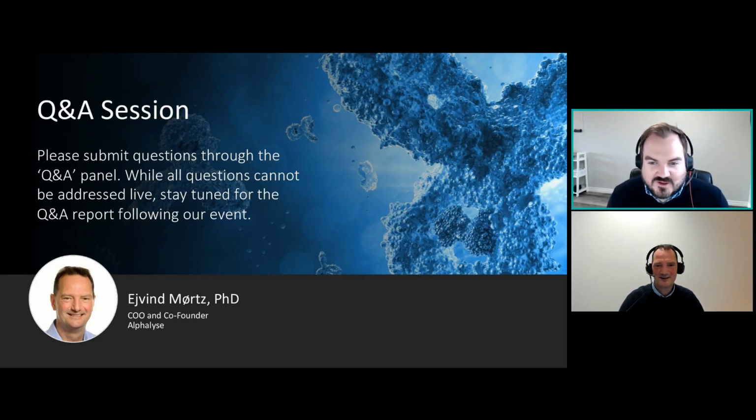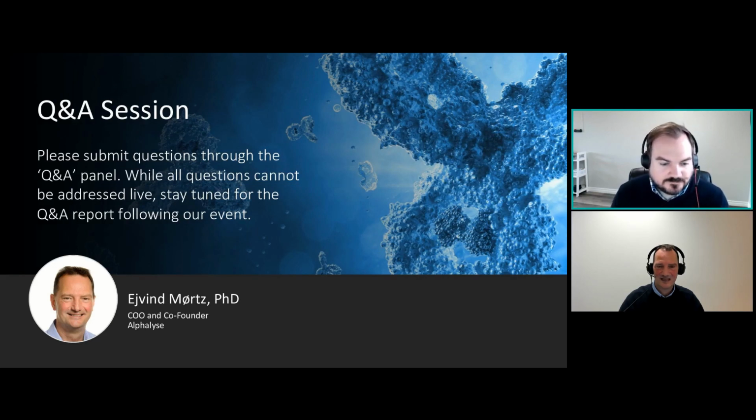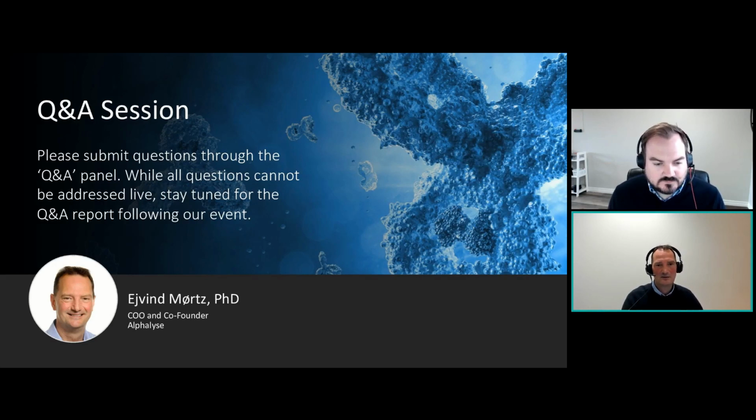Yes, I am. So hello again. Wonderful. So let's start with one here. We currently use an HCP ELISA and will need to bridge to new reagents next year. Can LCMS be applied for this? Yes, the short answer is yes. The long answer is that to bridge to a new ELISA, you have to do a new so-called HCP coverage analysis.